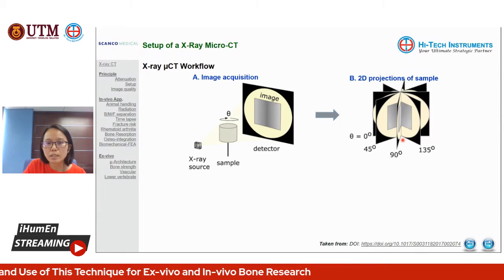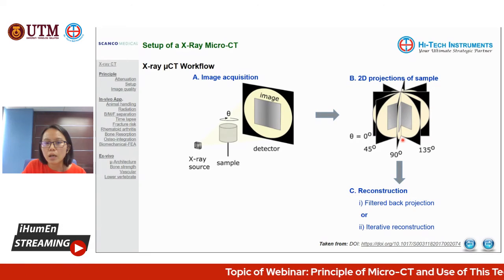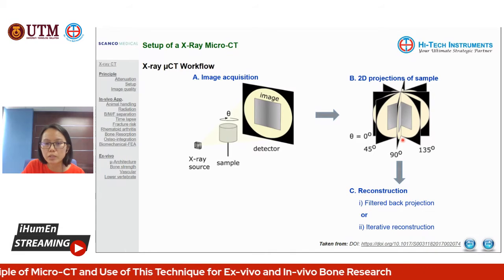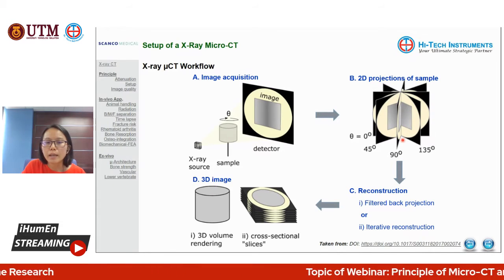So after these steps, all this data will be submitted for reconstruction. Basically, there are a few common algorithms for reconstruction. The common ones are called filter back projection, and also iterative reconstruction. And lastly, you will get the 3D image.